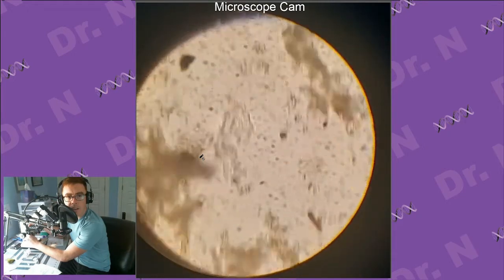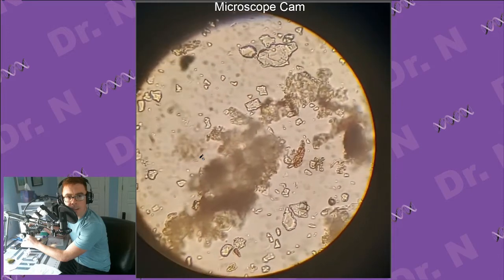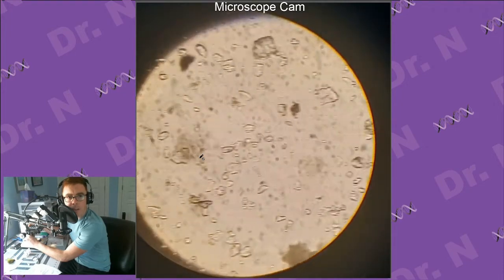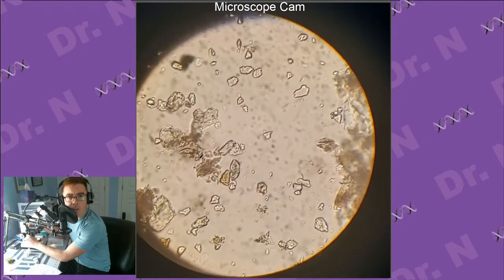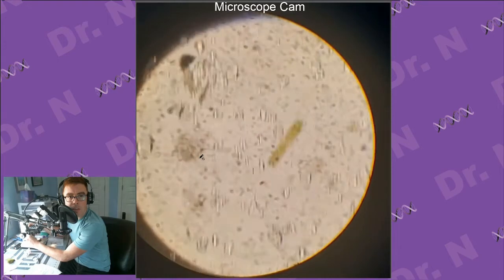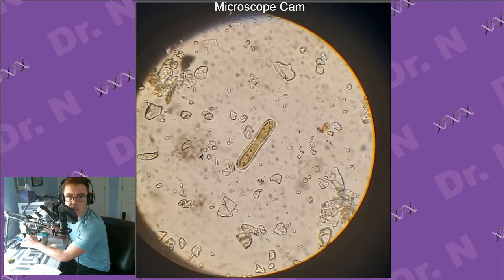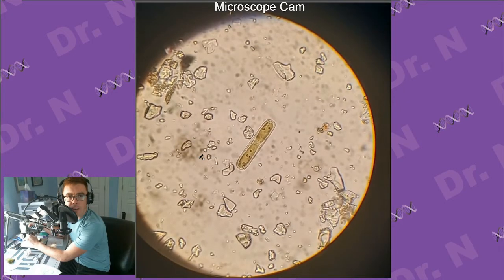There's that guy again. No one's moving though. That's sort of frustrating. Oh. Here's another one. Same species. So I wonder if that other one was in the act of dividing. This one seems a lot longer, and you can kind of see, if I zoom in and out, this sort of cell wall looking structure seems to be separating two different cytoplasms more completely than the other one. So I wonder if these guys are undergoing mitosis or cell division.